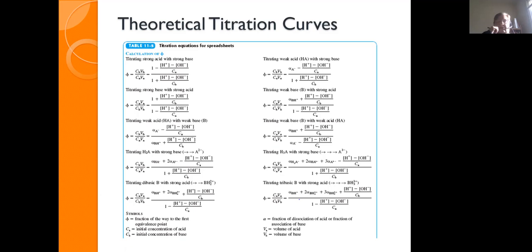The other thing that I will mention at this point with regards to titration curves in lab is that quite often with the sodium hydroxide titration, it does not finish the curve. So instead of doing something, it's not giving me, sorry, I've got to turn the pen on.